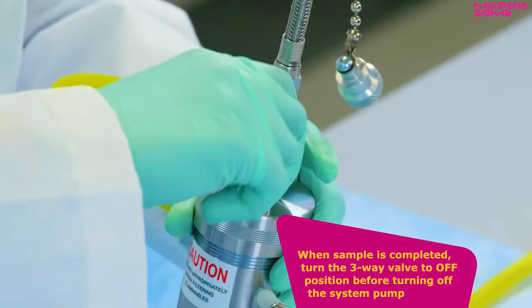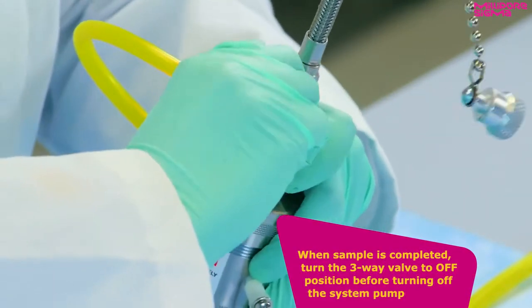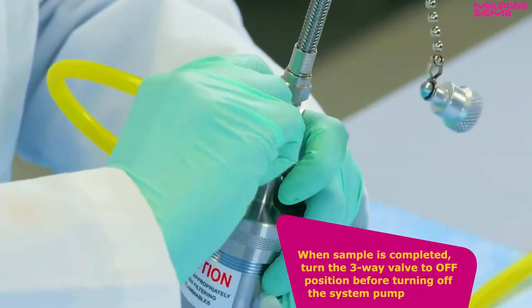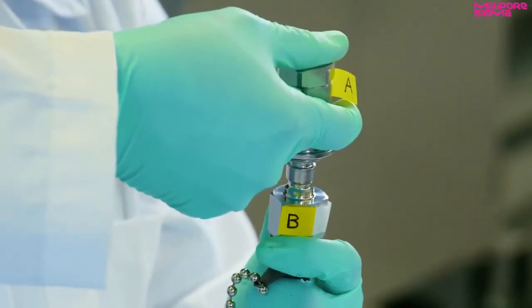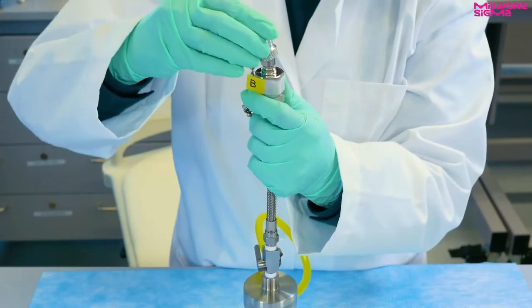When the sample is completed, turn the three-way valve to the off position before turning off the system pump. Remove the sampler nipple from quick release valve and replace the protective cap on the sampler.